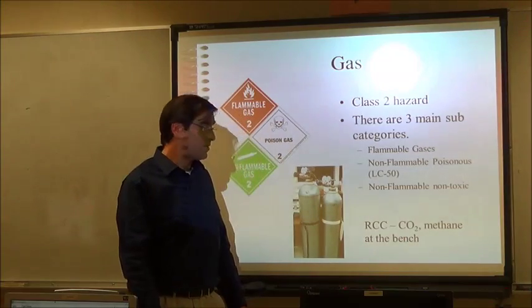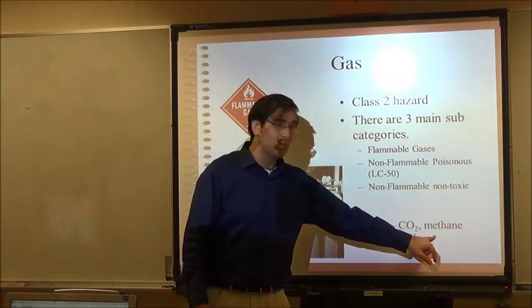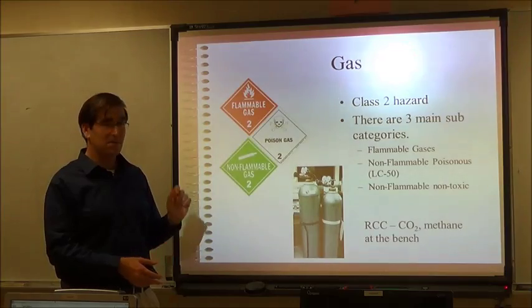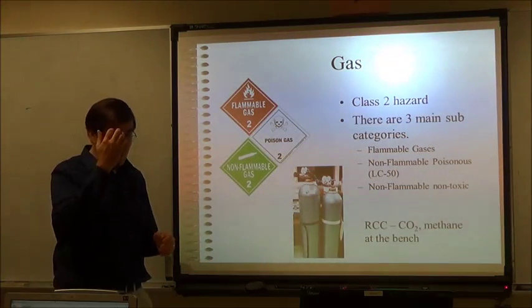But the one that's probably most often used, but least considered about, is the methane, which is the gas that we use at the bench. This gas obviously has a certain smell to it, so you know whether or not it's in the air and whether there might be a leak.